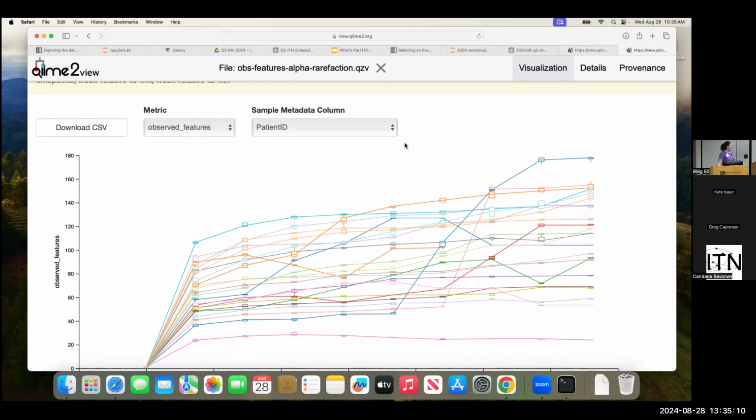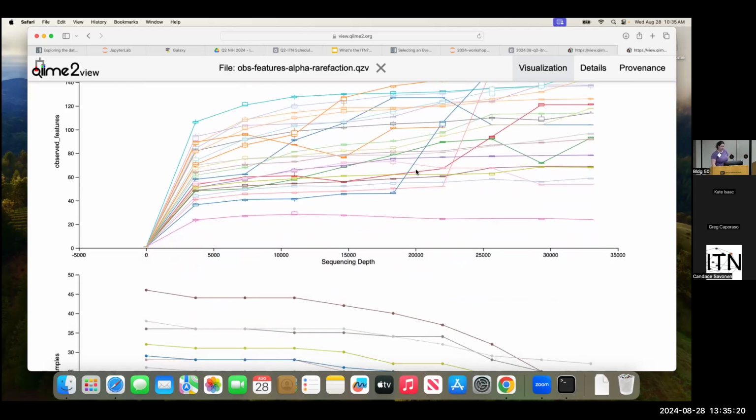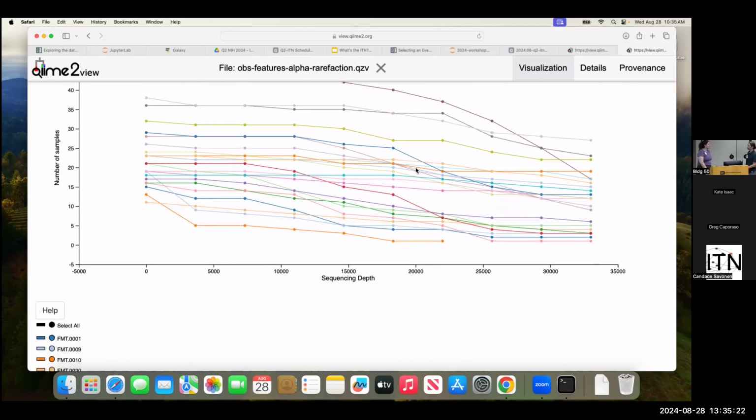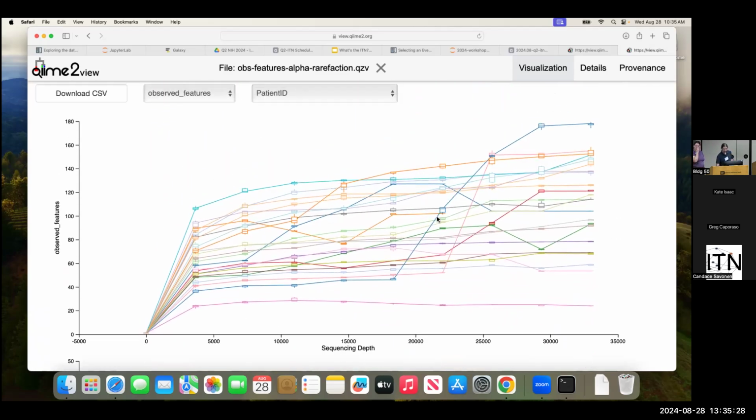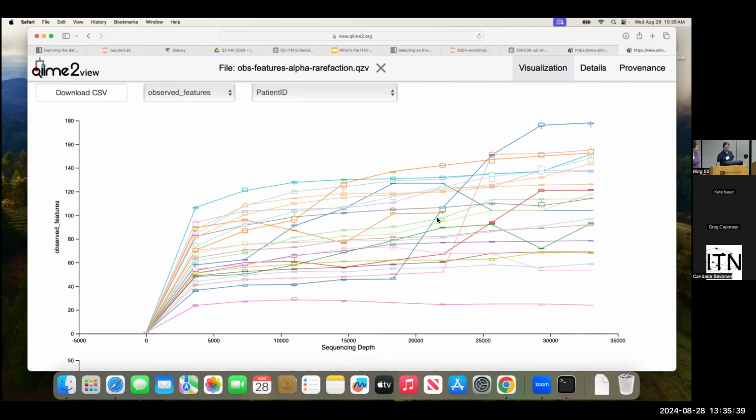And so, just a balance of representing the samples as best we can without losing too many features or too many samples. Yeah. One of the other things that I look at with this plot is, see this blue line is looking kind of odd, right? It seems to have leveled off and then all of a sudden it just shoots up. So why might that be?